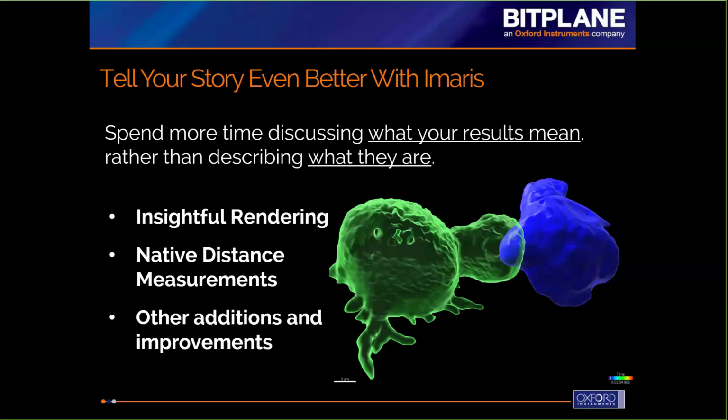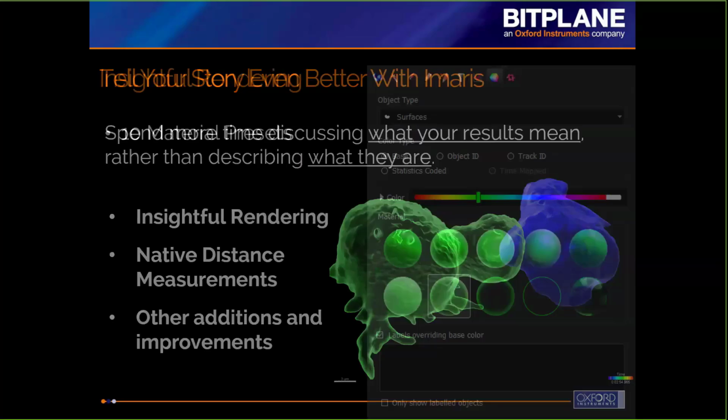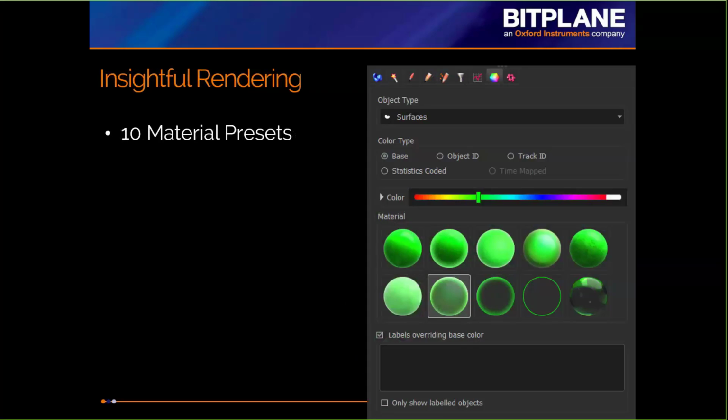Okay, so I'm going to turn back to insightful rendering because I want to go over what changes you'll see when you've downloaded the new version, or if you've not used Imaris before, how you'll interact with it and what it will look like so that you're not surprised.